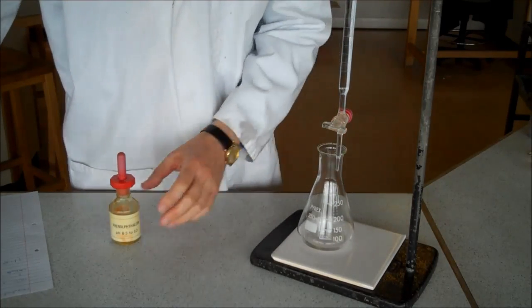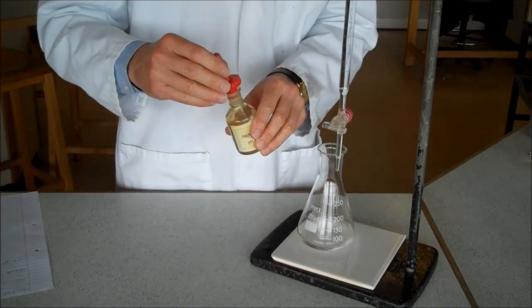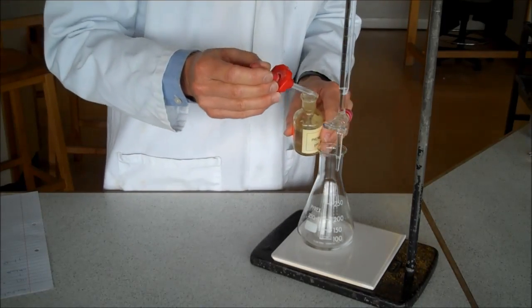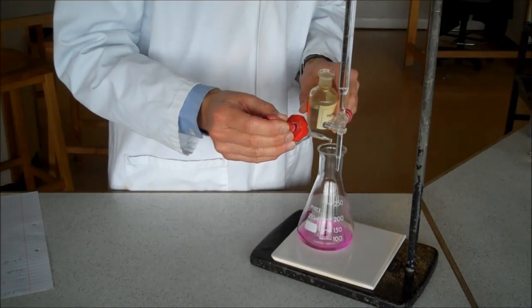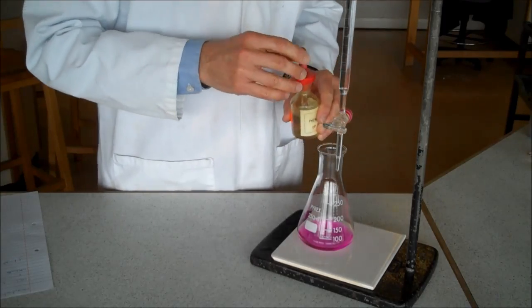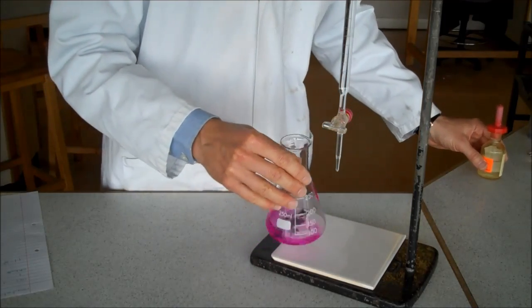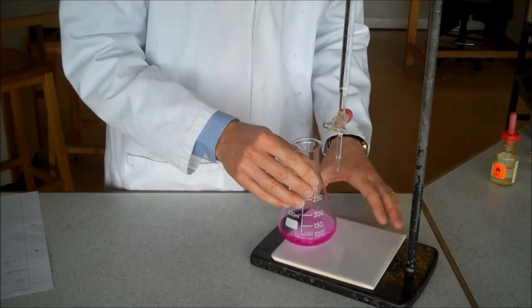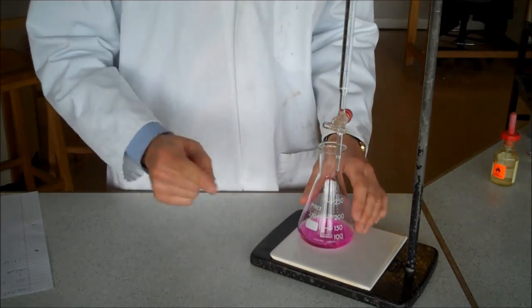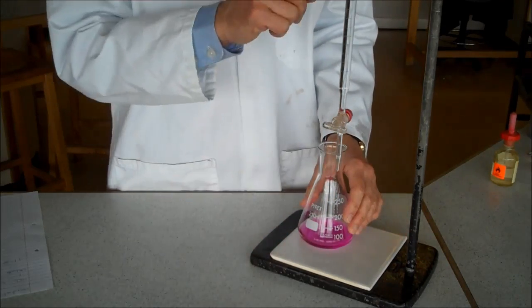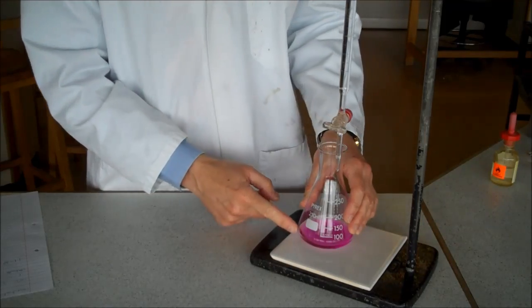Next thing, I need an indicator to tell me whether or not it's neutral. 1, 2, 3, 4, 5 drops of phenolphthalein gives a bright pink colour in alkali. So, my alkali's in there, my acid's in the burette, and at the moment it's bright pink.